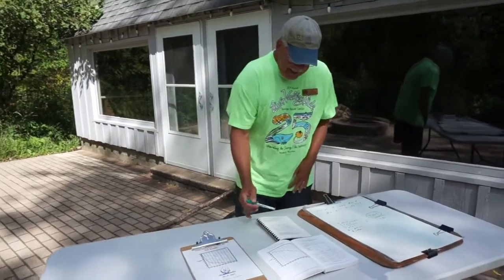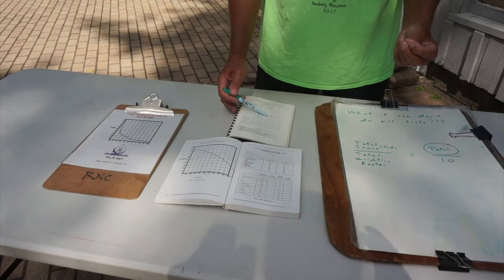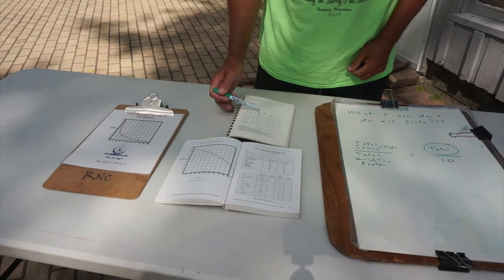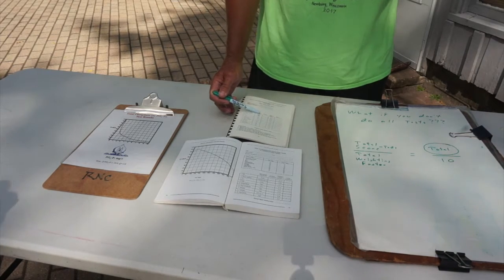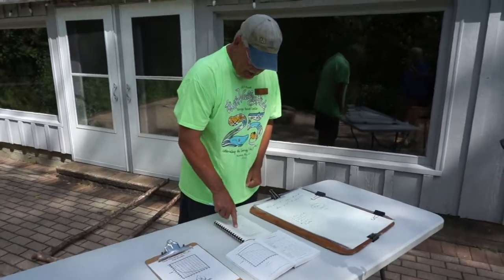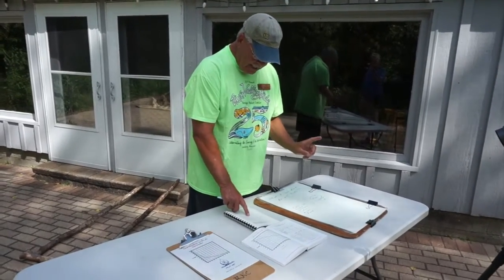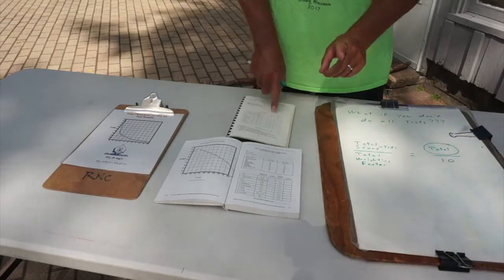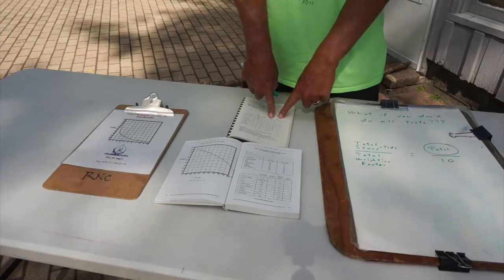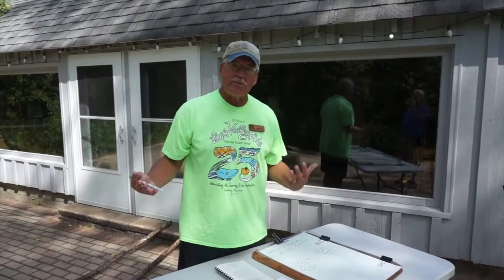To do this, each time you did a test, you came up with a Q value. And so there'll be 9 of them that you record right down here. Here's your 9. Column A is the actual chemical numbers that you use. So for instance, in the case of dissolved oxygen, you calculated percent saturation. But that translated into a Q value. The Q value then is going to be multiplied by what's called a weighting factor. The purpose of a weighting factor is because not all tests are as important as others.